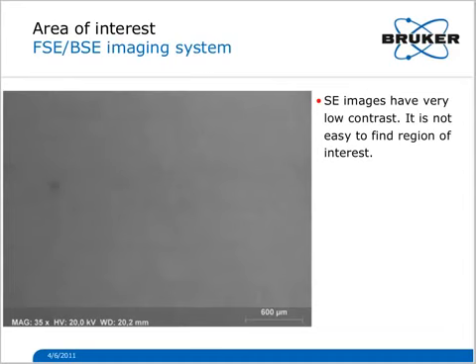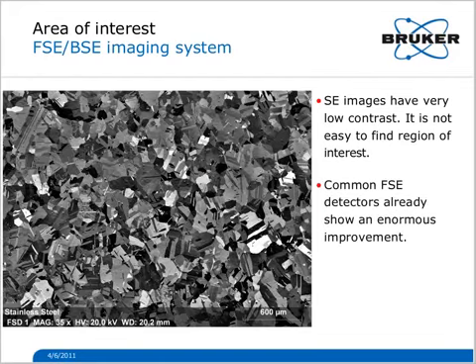How this looks like. Here, for instance, I show you an SE image of an austenitic sample. We have the typical contaminations which we can see in SE mode and a few dust particles which can be applied for the focusing. And you know that if we go now to a forward-scattered signal, the conventional one shows you grayscale images. You see immediately how nicely you see all these details.